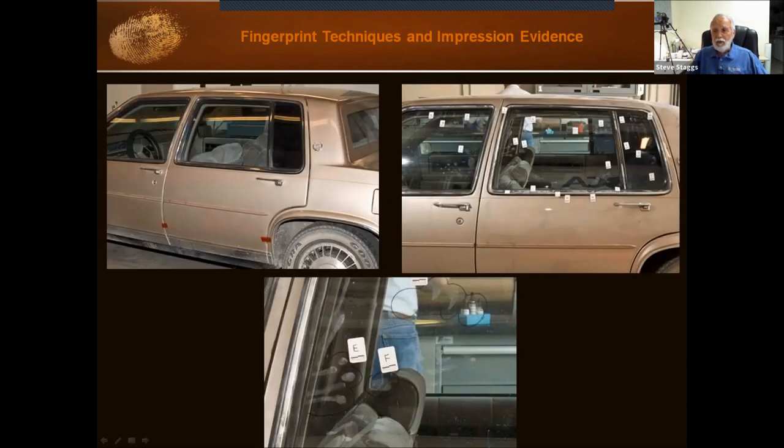Photographing where the latent is: here we see a vehicle with a lot of latents on it, and markers have been placed next to each one using letters. They photograph it so you can see all the letter markers and then the close-ups — there's really a nice set of prints here. If I was doing this photograph, I would have someone on the other side of the glass put a piece of contrasting paper against the inside of the glass, so you can see the prints without looking through the glass and seeing somebody's hip pocket or the headrest of the car.